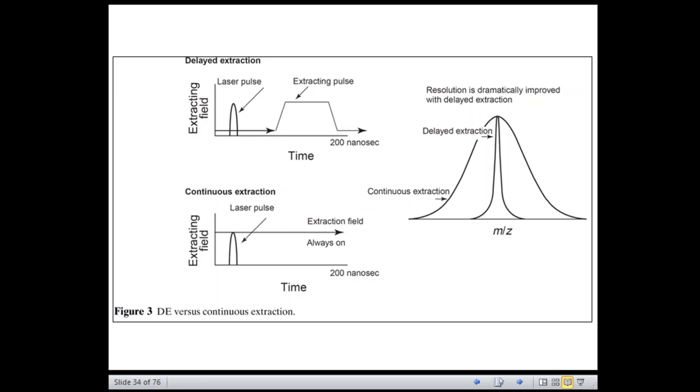So what is the advantage of this cooling phase? This cooling period generates a set of ions with a much lower kinetic energy. When they have lower kinetic energy, it ultimately reduces the temporal spread of ions once they enter the TOF analyzer.